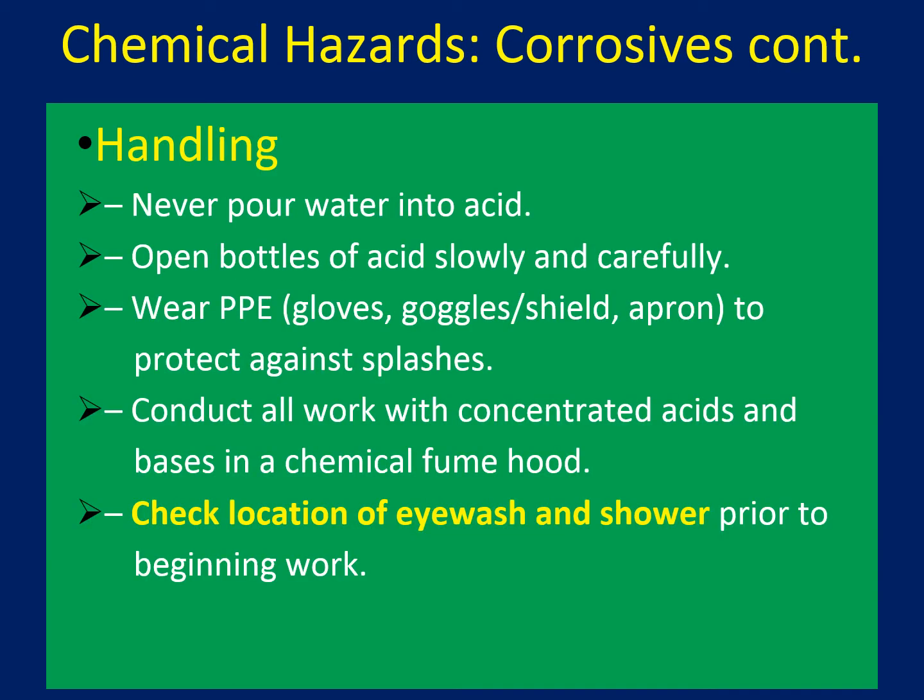There are a few more things I need to share with you about the handling of chemicals. Never pour water into acids, because acid can splash into your eye. So add acid slowly, drop by drop, into the water, and open bottles of acid slowly and carefully.